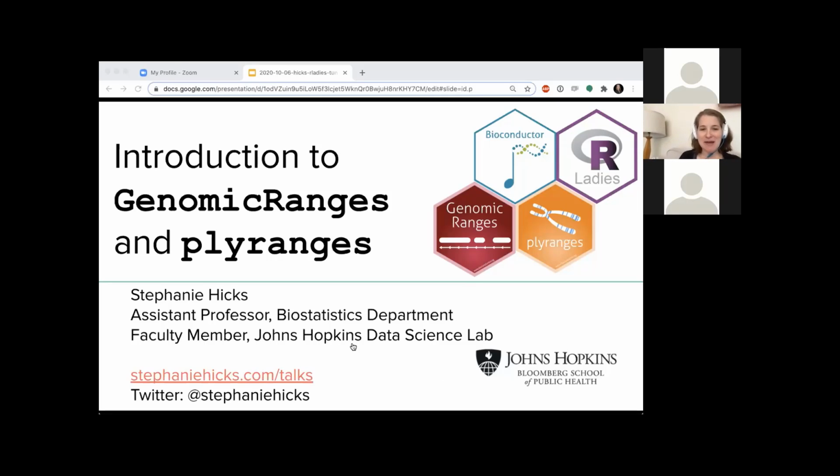Today I'm going to talk about two packages in the Bioconductor ecosystem. If you're familiar with CRAN, Bioconductor is kind of like a cousin or a sister to CRAN for R packages that are developed for biological data. GenomicRanges and plyranges are specifically the two.